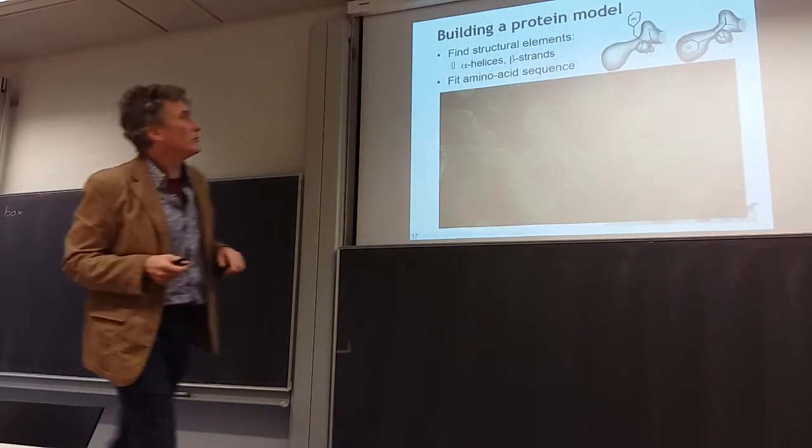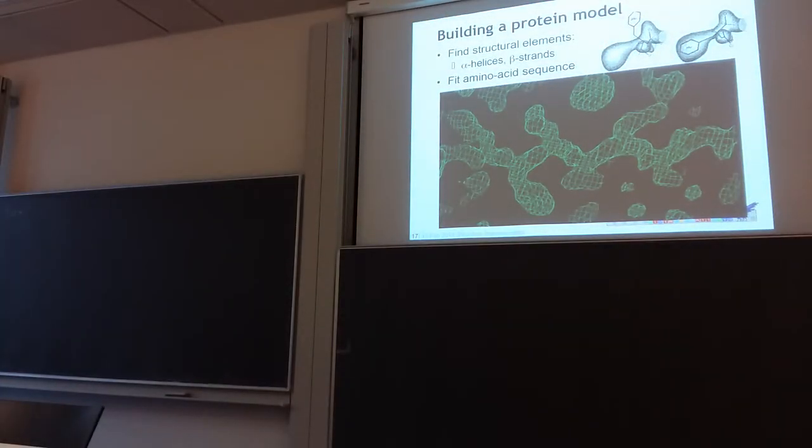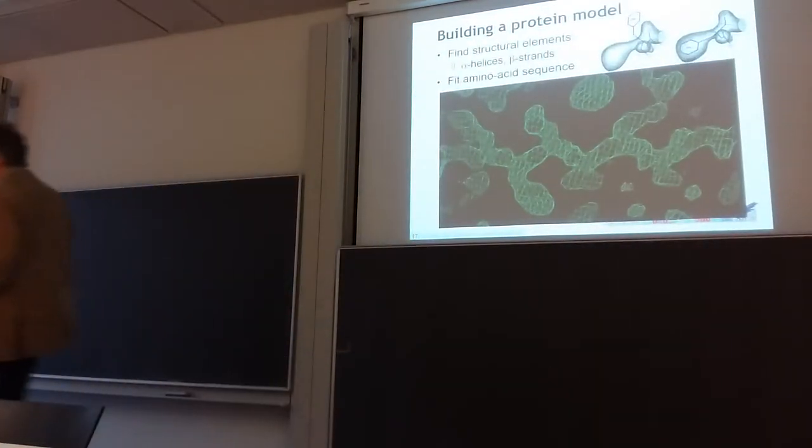So, what's next? If you've actually done this, then you get what I already mentioned, the electron densities. And that looks a little bit like this. There's an increasing number of density maps also deposited in the, I'm not sure if they go in the PDB or they go into an associated database, but at least you can access them also through the PDB. And it looks a little bit like this, right? Oh, I went back to, I'm still on last year's.